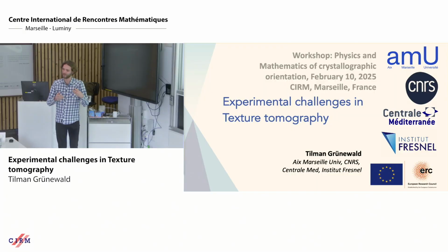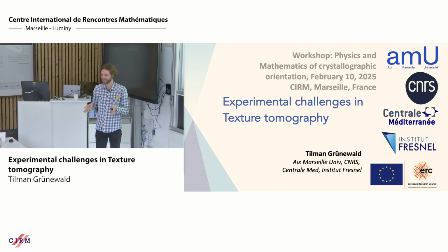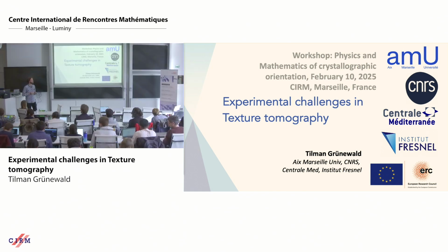Good. So now we have a solid basis of texture, X-ray focusing. So now we can actually think about doing experiments. And that's what my talk is going to be about: how to do the experiment, which are the pitfalls that I encountered.